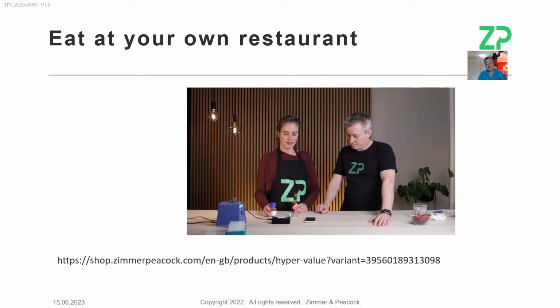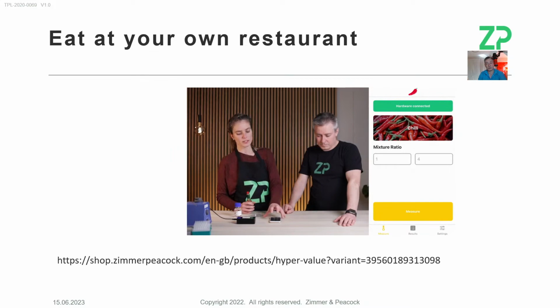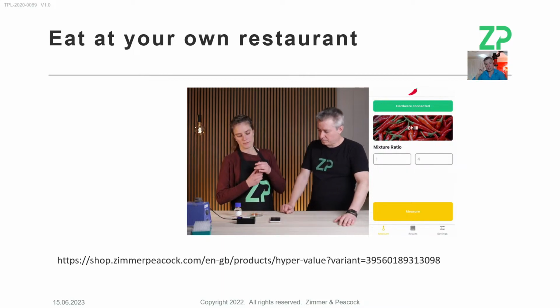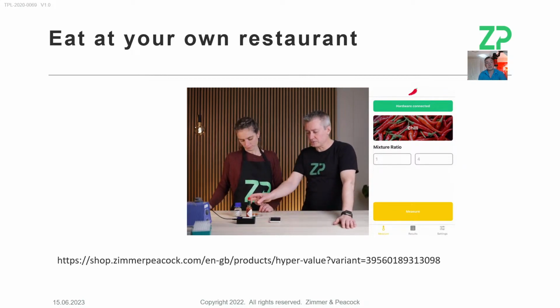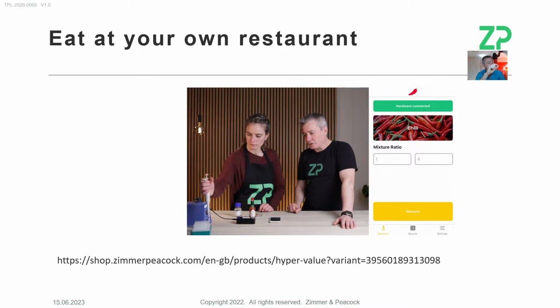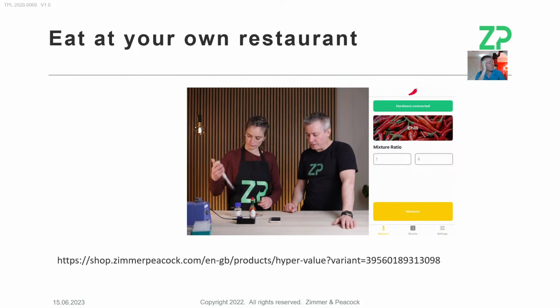So when we sell screen printed electrodes on our web store, we're essentially doing that as a service to the community, because we need these electrodes whether we're selling them on the web store or not. And when you look at some of the videos that we make, you'll notice that we're not doing a calibration in some of our applications. The reason is that we've controlled the manufacturing. A lot of the time, especially when you read scientific papers, they normalize signal because they're trying to get rid of manufacturing variability on the underlying electrodes.